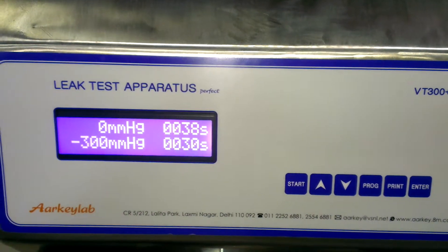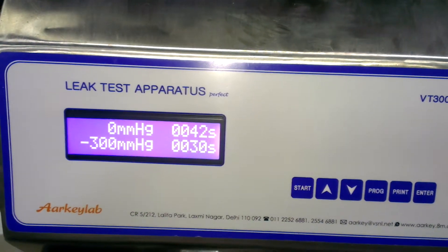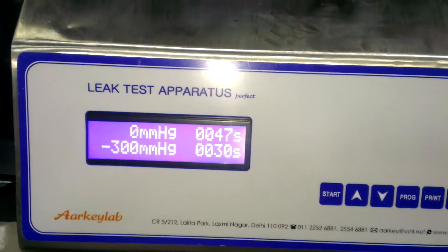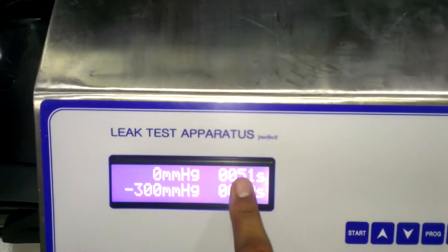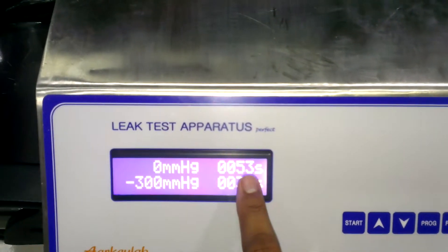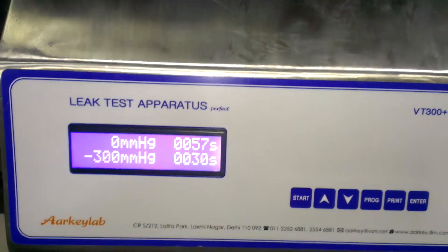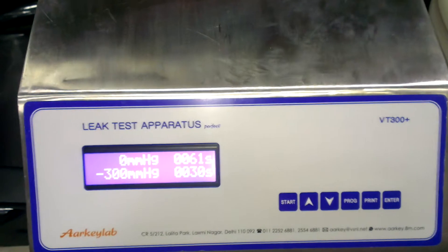Now it starts the retention time — 120 seconds. This timer will run for 120 seconds. After 120 seconds, the cycle is over.